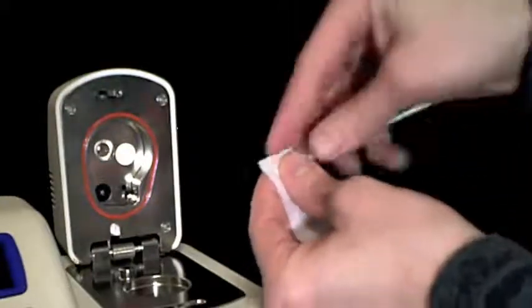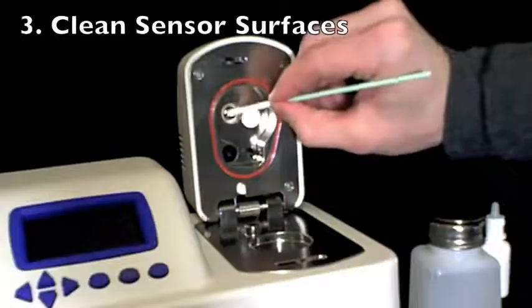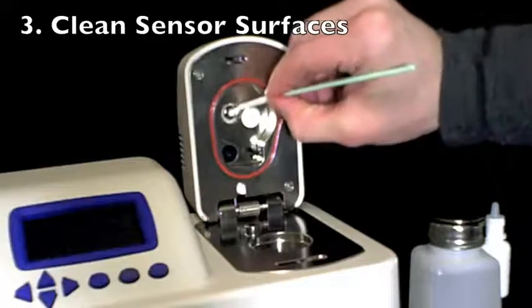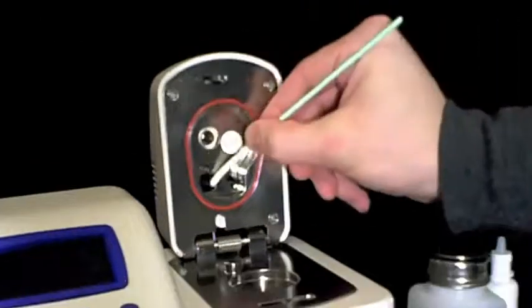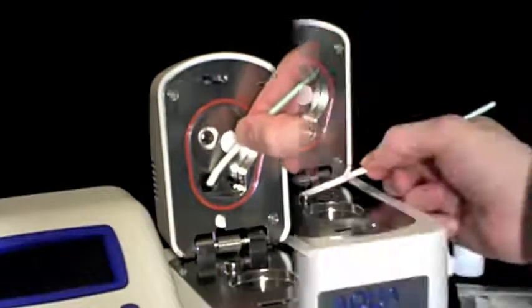In the next step, we use the same technique to clean the surfaces of the sensors within the sensor block. First, take a clean kimwipe, apply a cleaning solution, and clean the thermopile, the mirror, and the optical sensor.